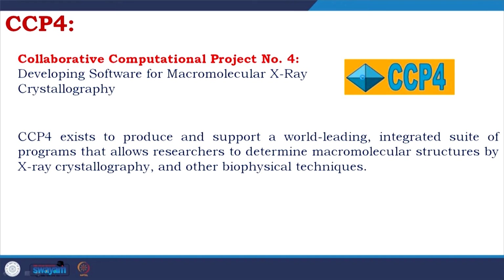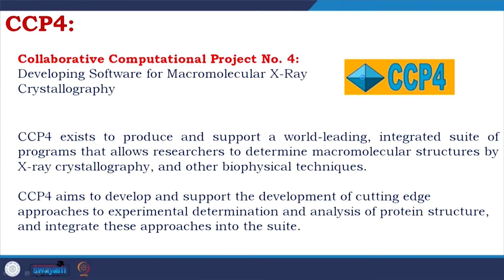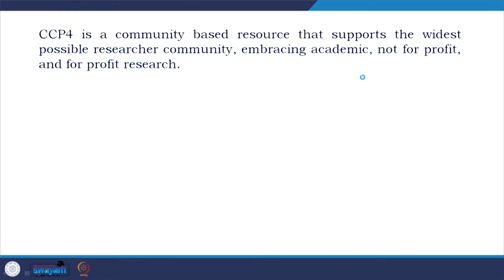So, they started with X-ray crystallography, but now they definitely help cryo-EM, NMR, and other spectroscopic techniques can also get their analysis using CCP4. CCP4 aims to develop and support the development of cutting-edge approaches to experimental determination and analysis of protein structure, and integrate these approaches into the suite. CCP4 is a community-based resource that supports the widest possible researcher community, embracing academic, not-for-profit and for-profit research.